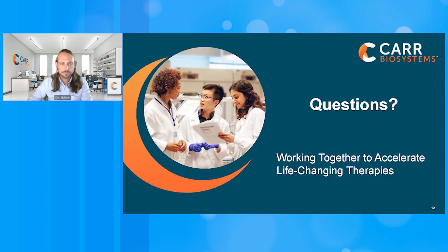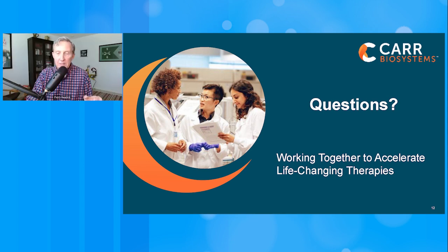Thanks, Dan. Really good question from an audience member. They have a DSC at large scale but lack a small scale model. Can the tubular bowl centrifuge be tuned to replicate the conditions of a large scale DSC?